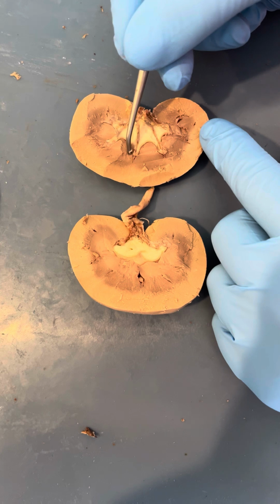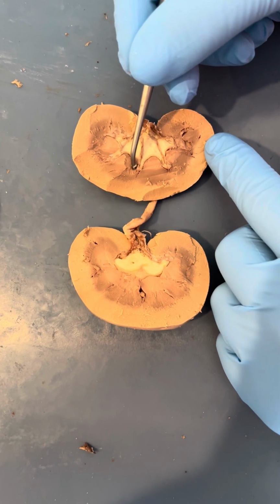Then you can see my index finger pointing to one of the renal lobes, which is one of many lobes that surround the renal pelvis. These areas are made up of the renal medulla, and these areas contain nephrons, which are responsible for blood filtration and urine production.